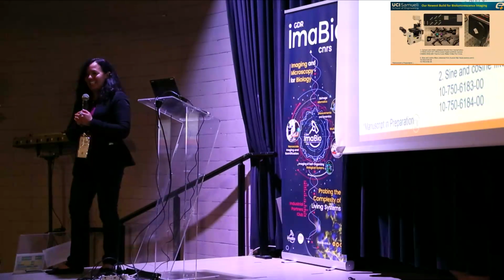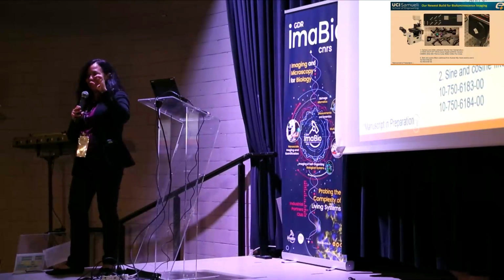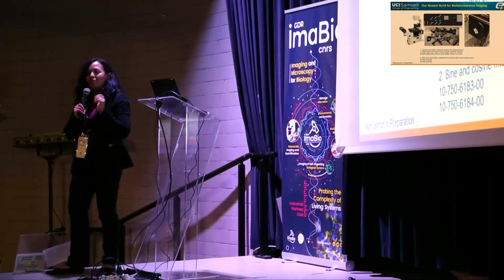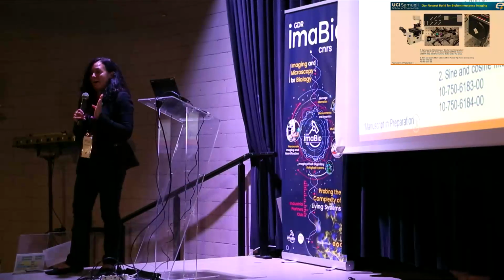And also with this kind of phasor, because it's really impressive, this circle, no? Okay. Yeah, I think that Lorenzo's paper was simultaneous, but you get the data in different matrices, right? So you have your spectral detectors, right, for this. Yeah, I think the commercial microscope has integrated both. So you get spectrally resolved lifetime data. I don't know if they use the phasor, so I don't, yeah.